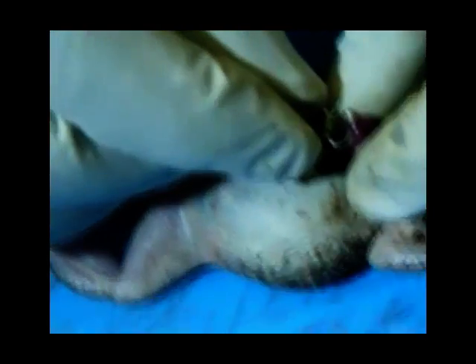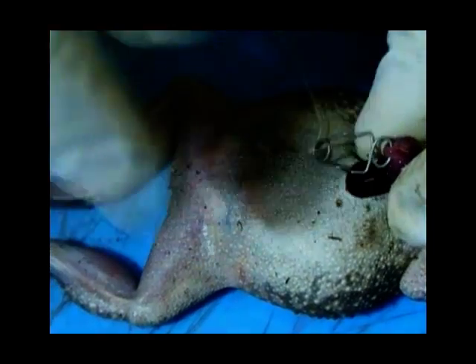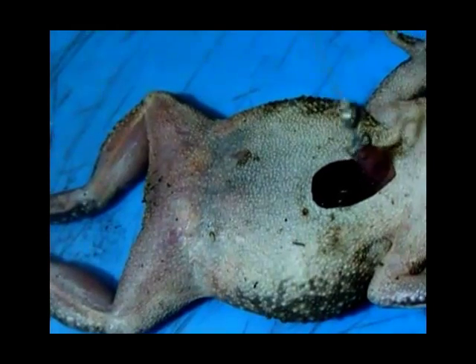A small hook is then inserted into the muscle at the tip of the ventricle and the heart pulled upwards out of the thoracic cavity.